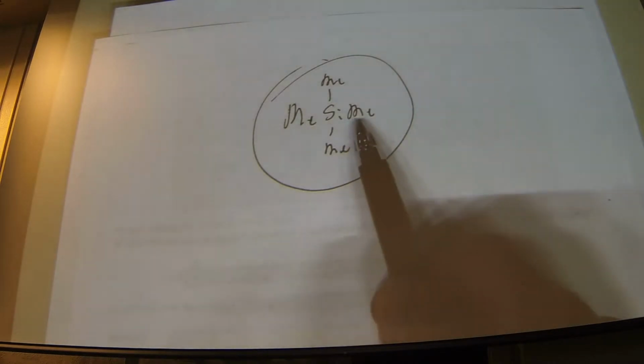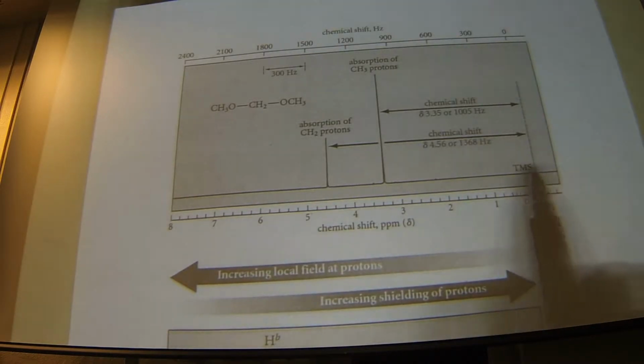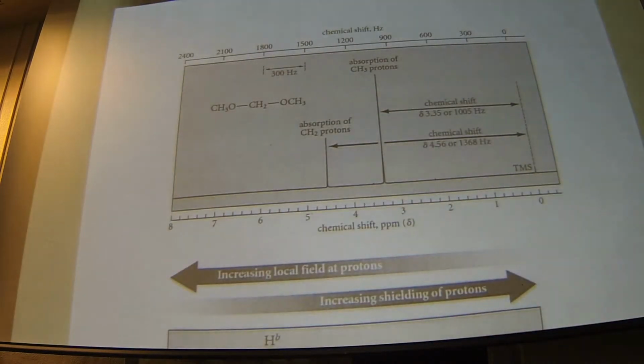And for reasons that I'm not going to go into right now, that peak appears in a part of the spectrum where few, if any, other things appear. So it's a nice reference. So all these peaks are going to be referenced to TMS. Okay.